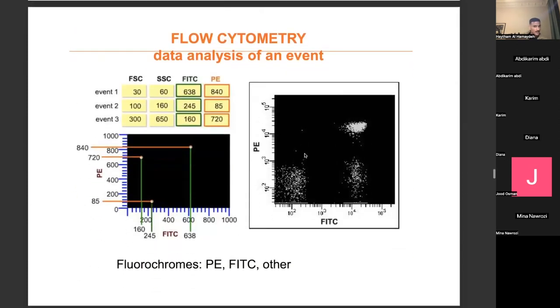This is telling us I have two separate antigens. Let me connect this to the same exact thing we took in class. FITC and PE are CD8 and CD4. What are CD4 cells? T helper. What are CD8? Cytotoxic. Now, remember this: plus, plus, plus, negative, negative, negative.